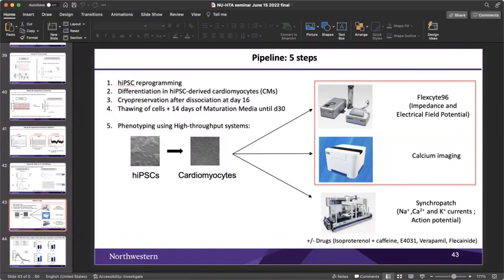Okay, so physically speaking, all these instruments are situated in the pharmacology department? Yes. Okay, and the synchropatch, because I know there's a synchropatch that Carlos uses. Yes, that's this one. In fact, I've done some experiments with that, but I just wondered if this was another one that you're using or whether it was the same one. Okay, so there's just one of them around and it does these recordings. Okay, all right, so that explains it. Thank you very much. Thank you.